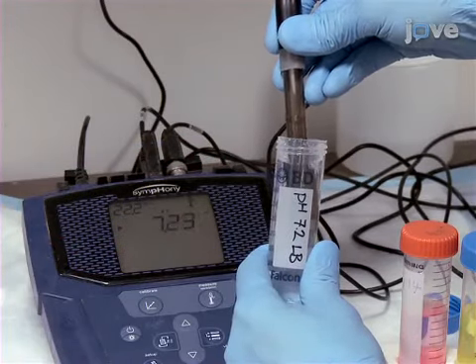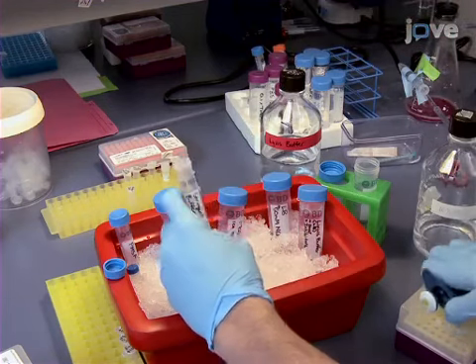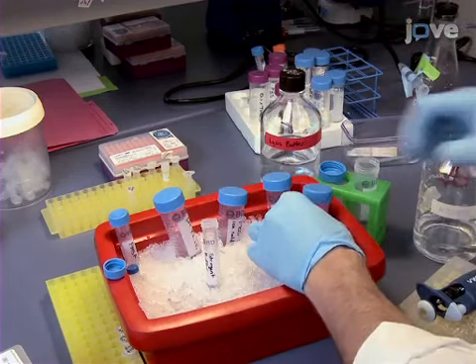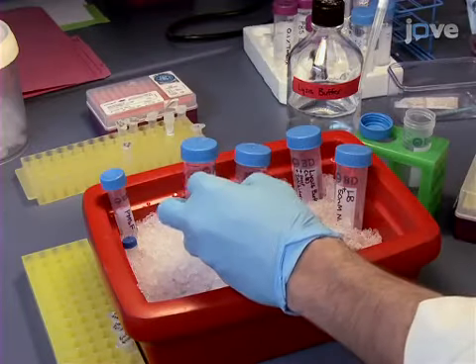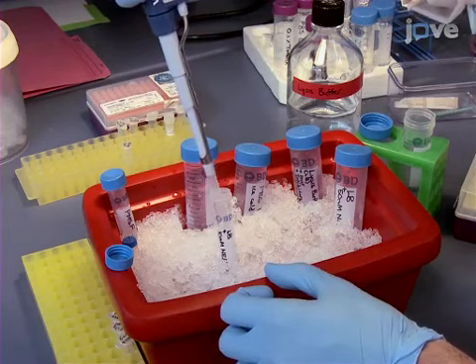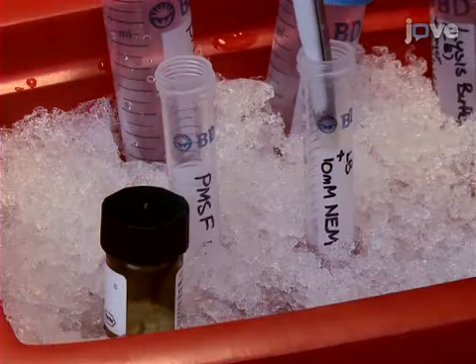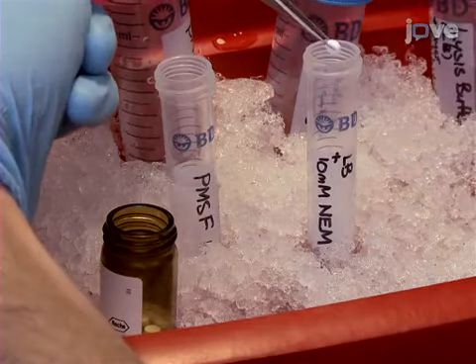Per sample, prepare 2 milliliters of lysis buffer, pH 7.2, and 0.5 milliliters of stringent buffer prepared in lysis buffer. Also prepare 0.5 milliliters of lysis buffer plus 10 millimolar NEM per sample. Add PMSF and protease inhibitor tablets to all lysis buffers.